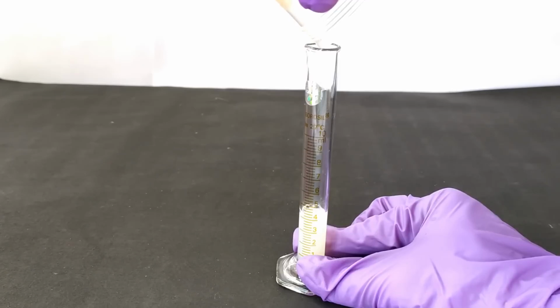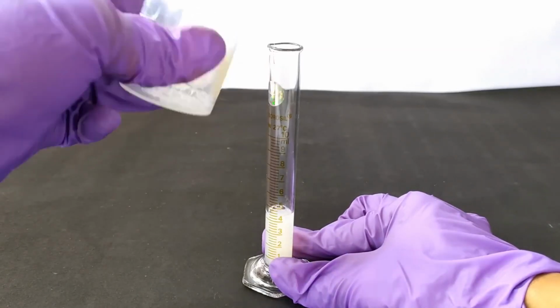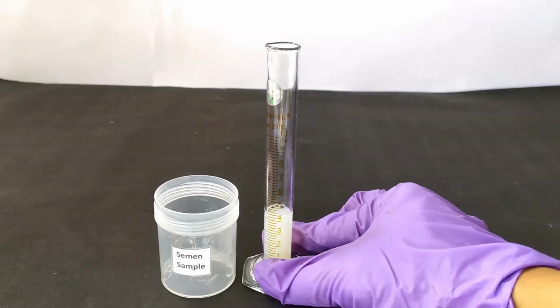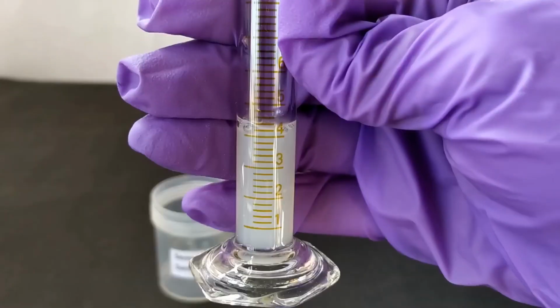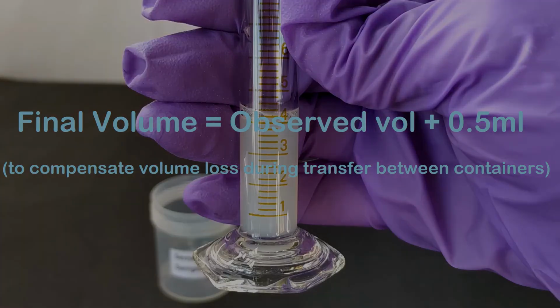Wait a couple of minutes for the sample along the inner walls of the cylinder to settle down, and note down the volume. Add a volume of 0.5 ml to the observed volume in order to compensate for the semen sample stuck to the walls of the collection container.